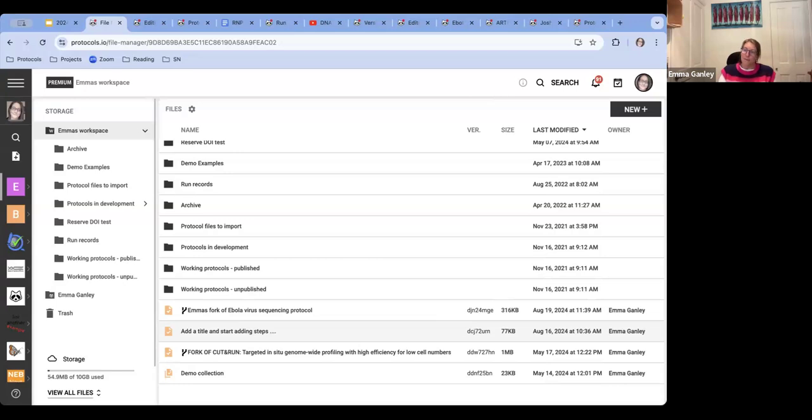Going through all of your questions, Gary, they are all very good questions. So does protocols.io link with any existing electronic lab notebooks?